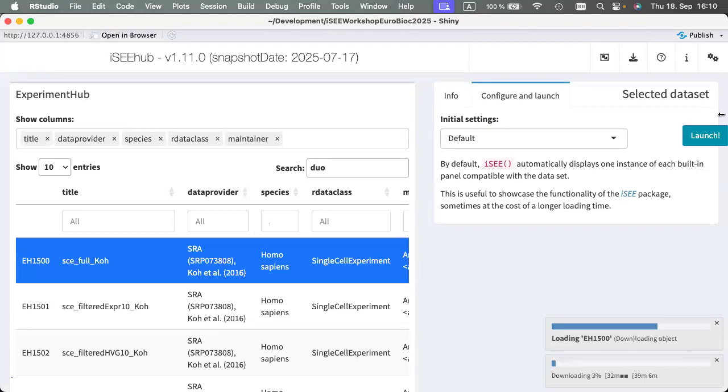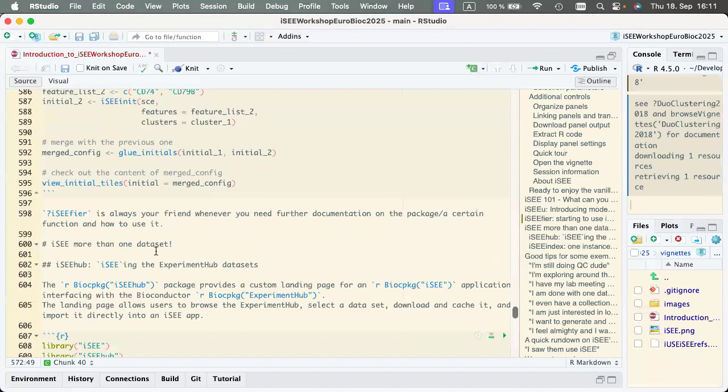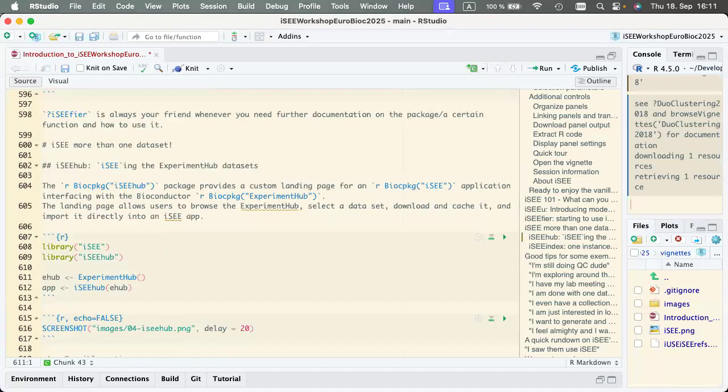Five years later with this kind of connection. But you can imagine that, not when it's done. Come on, let's just do it properly. See, which one was a small one? I don't know.